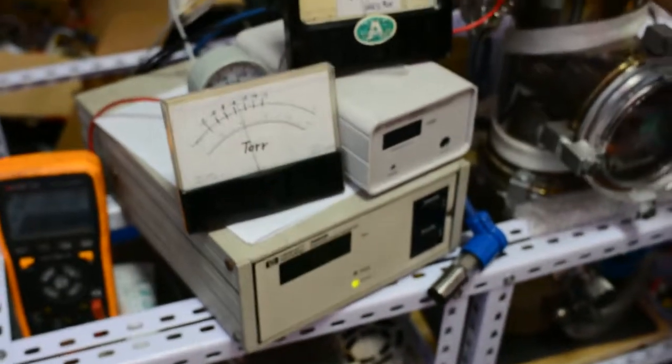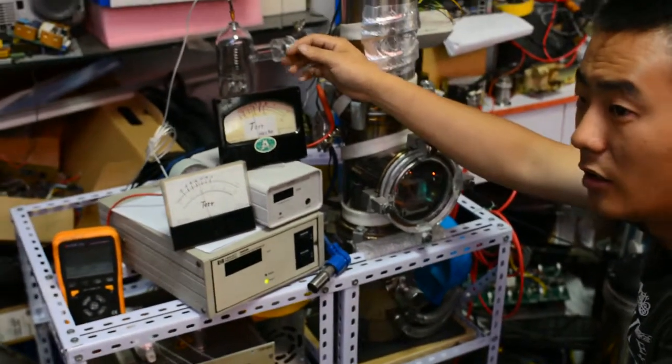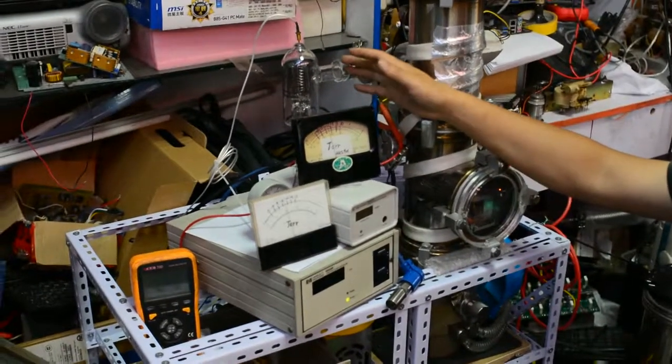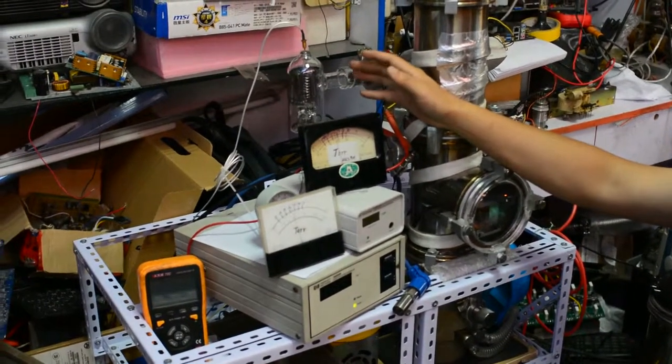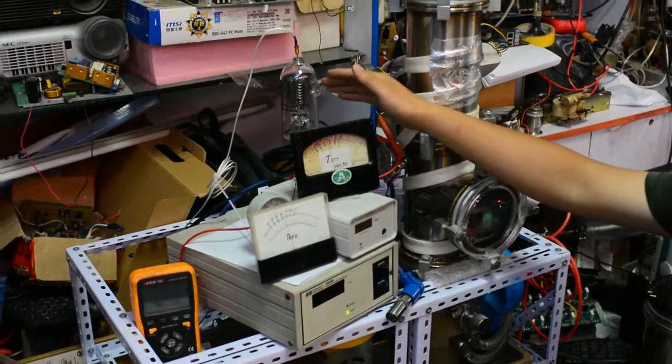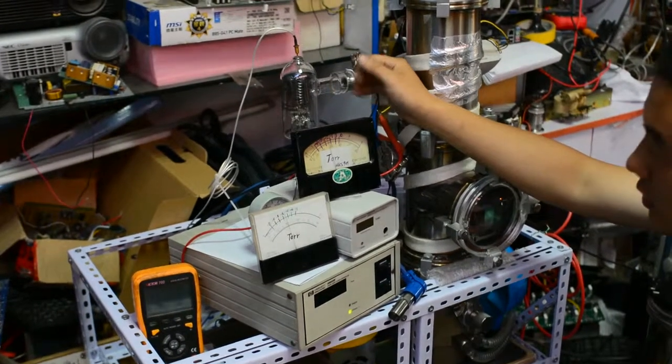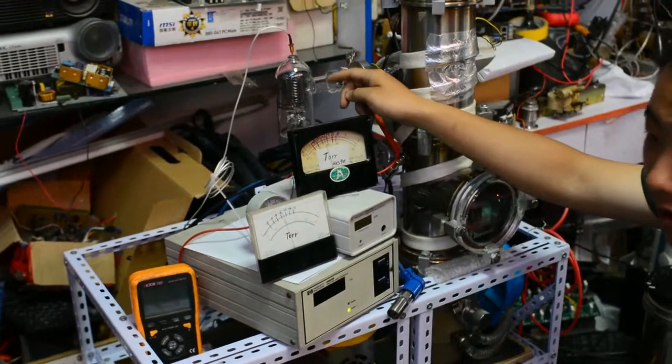Basically, the degas power supply will apply a voltage of about 5 volts and 10 amps to the ion gauge grid. It will heat it up very very rapidly.